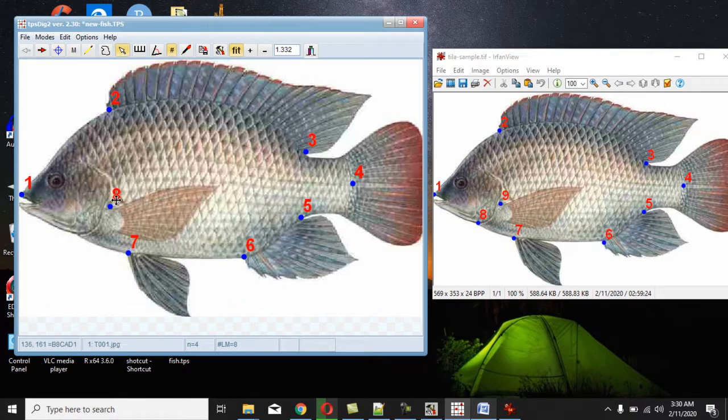So I move this guy to this place. Okay, because I made a mistake, so I move this guy. I move them to this place. So now I have to move and I have to see this 8 now. This should be 8. So now you will be here. So in case that should happen, you have to know how to find your way around. It's good I made that mistake so you can see. So we have 9 landmarks now.